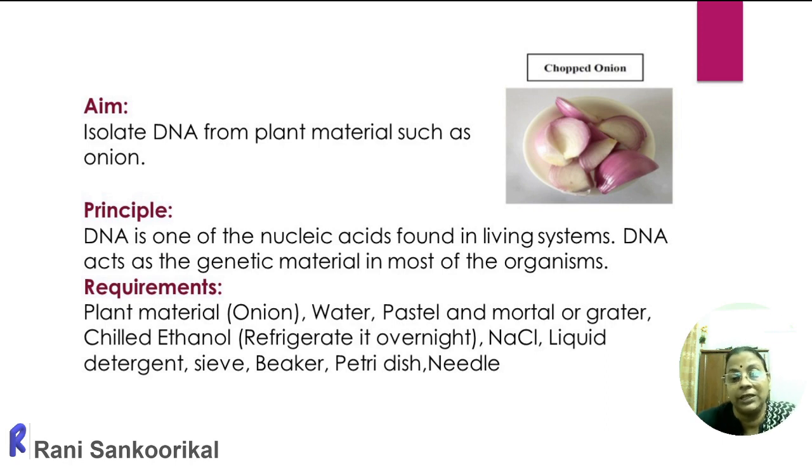With the help of this chemical, we can achieve complete lysis of the plant material. The cell wall and the cell membrane, and inside the components, even the nuclear membrane will rupture. So the DNA can be taken out or will come out from the cell components.